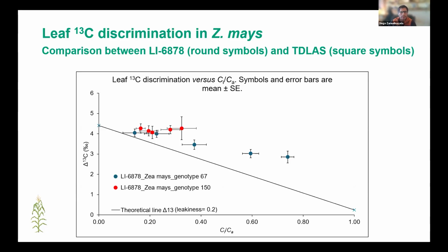Additionally, we added previous data that was collected in 2022, but in this case, they used a different tool known as the TDL, and we can clearly see that both data sets overlap, which gives us a good idea of how precise this new system is.